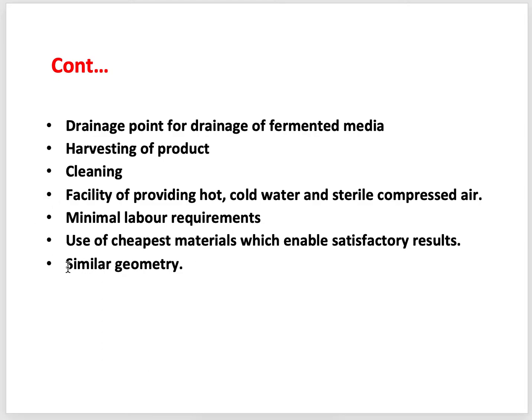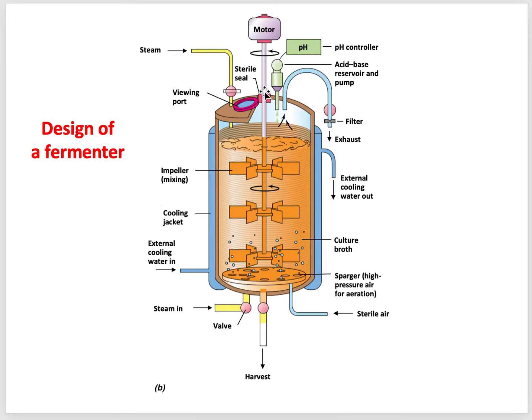So what you understand by similar geometry means that we don't just go directly to the final big fermenter, right? Before that, we scale up our process. First we develop the process in the lab, then we scale it up.